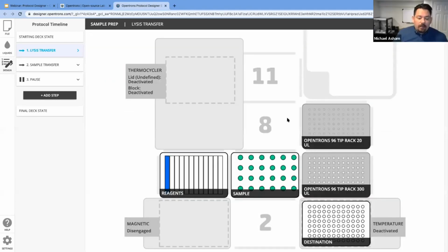Thank you for that. Next question is, can we prime the tip? Basically, the term I think you're used to is condition the tip before transferring a desired volume. Viscous samples may stick to the pipette tip if we do a single draw and release. So this is more liquid class centric. For all liquid class related questions, I would encourage our audience to watch our very specific liquid class webinar. But Catherine, I think you're more than apt to handle this as well.